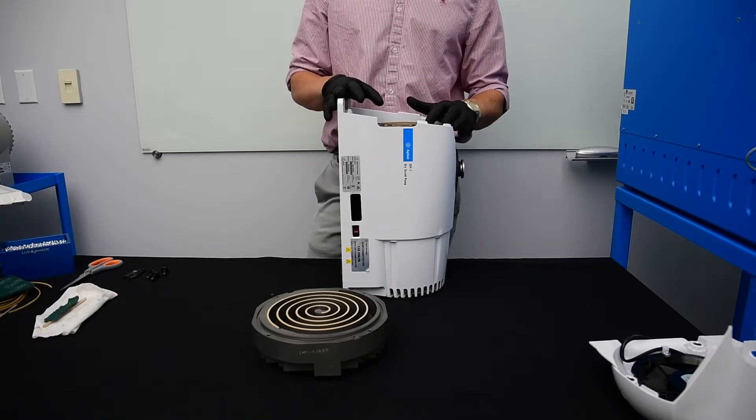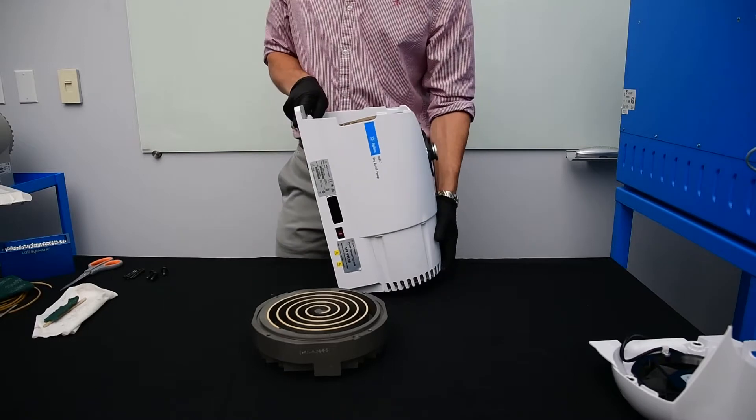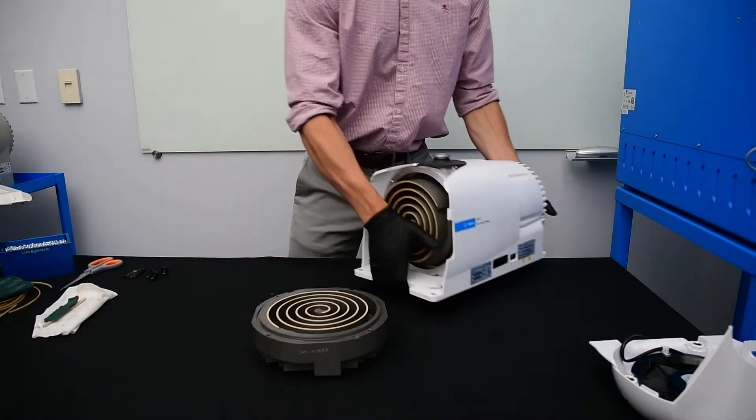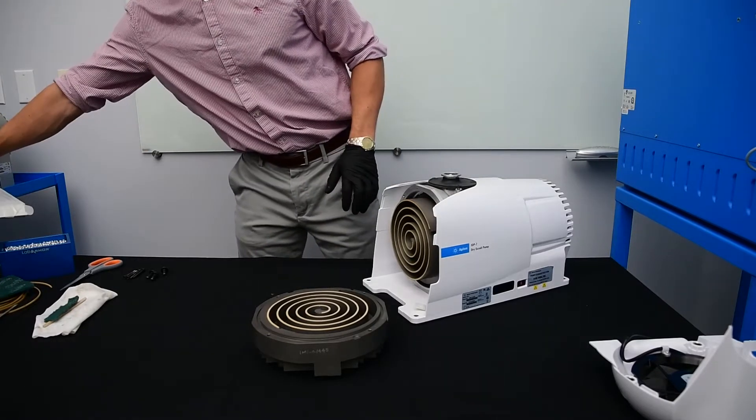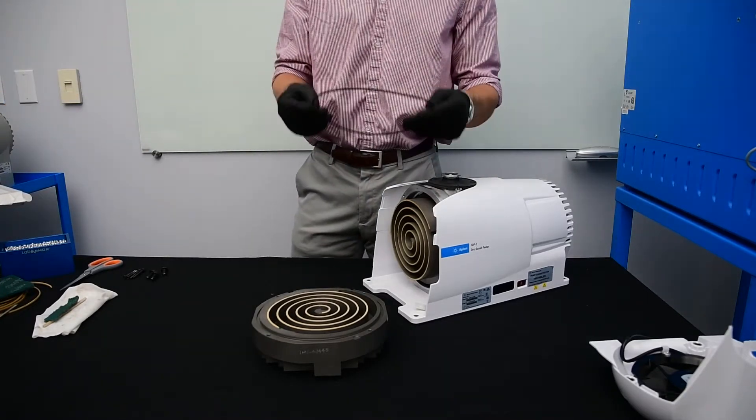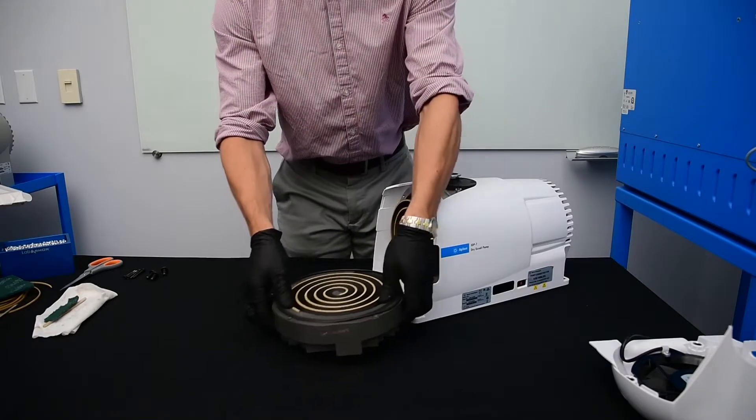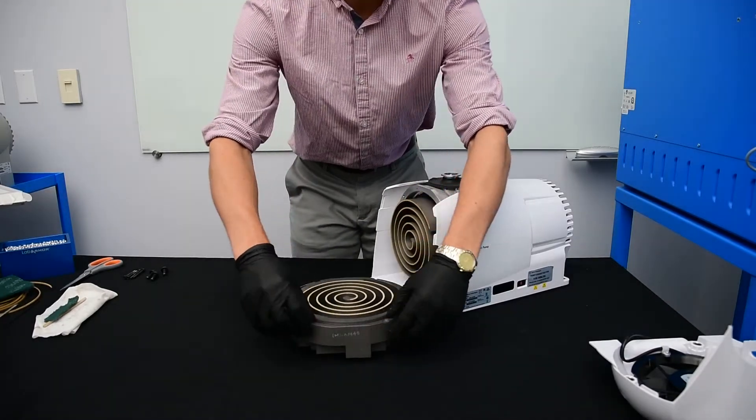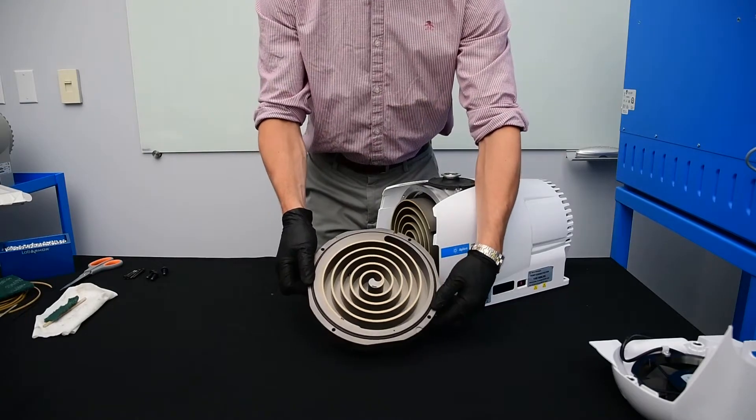So now I've just finished installing the tip seal into the orbiting plate. I'm going to put the pump down on the table and grab my new o-ring from my tip seal kit. We're going to install it in the groove.